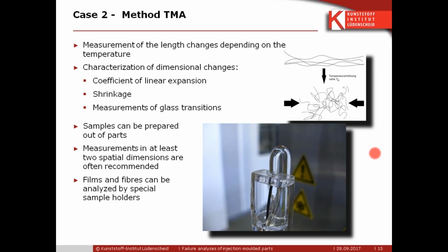Okay, formation of the chips related to the density. Since injection molding will probably get a higher density. So yes, also thinkable, but it was not part of it. We didn't do some milling tests at the Kunststoffinstitut.